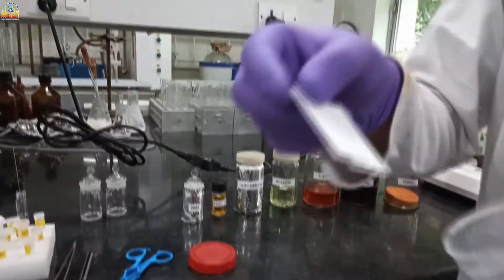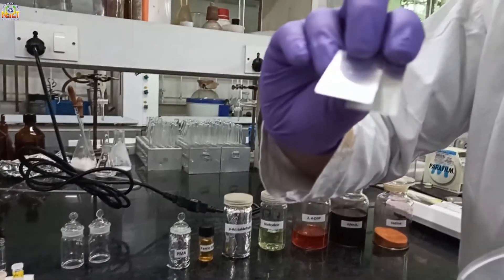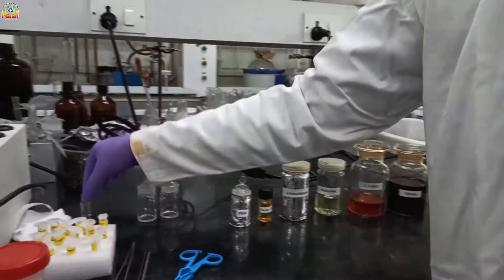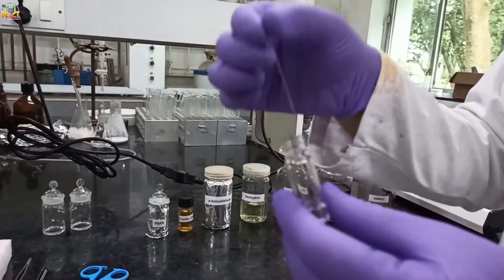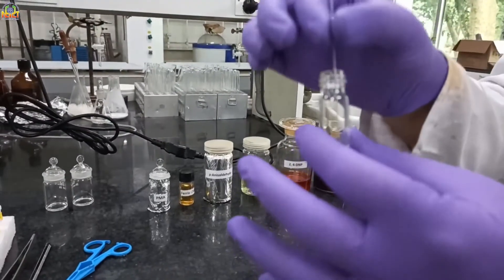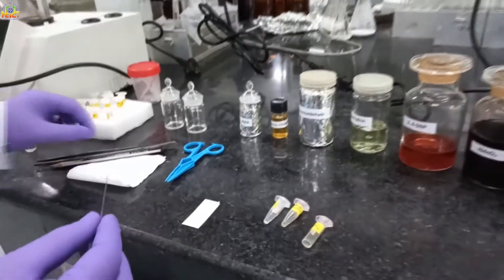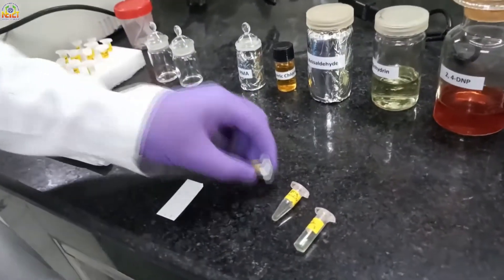You can see the TLC plates here — they have silica on aluminum foil. And this is a small glass capillary for spotting the compounds on the TLC plate. I am going to show you how we spot the compounds.